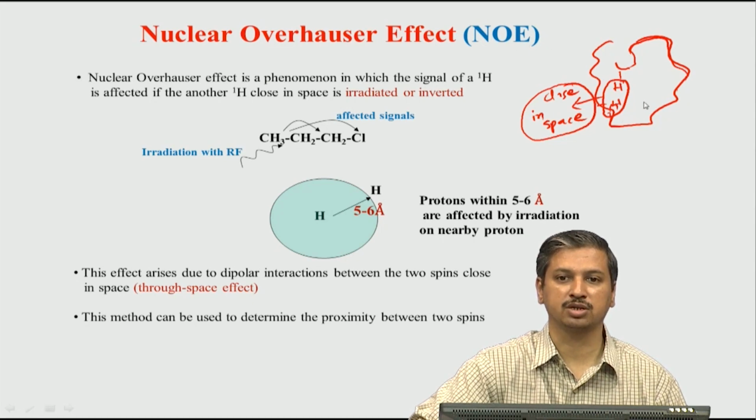So, therefore, NOESY occupies a very important place in NMR. In fact, for biological molecules this is very useful, because biological molecules, remember, have a very complicated shape, and the distance structural information can only be obtained through this kind of an experiment. That is one of the reasons why Kurt Wuthrich was given the Nobel Prize, because he pioneered the use of NOESY for structure determination of biomolecules. In fact, all structure determination in NMR has to have a NOESY component, because no other experiment gives direct structural information as you get in NOESY.